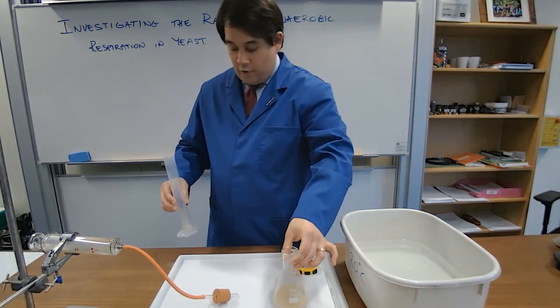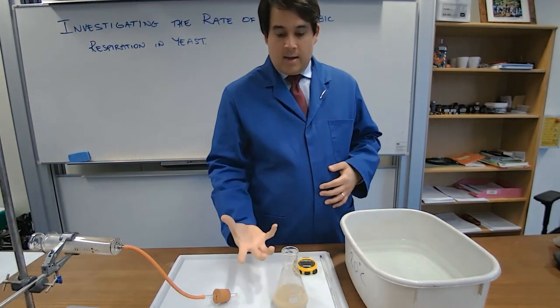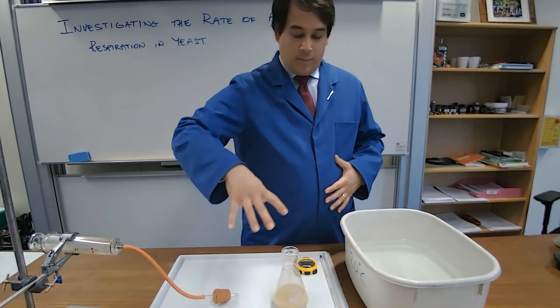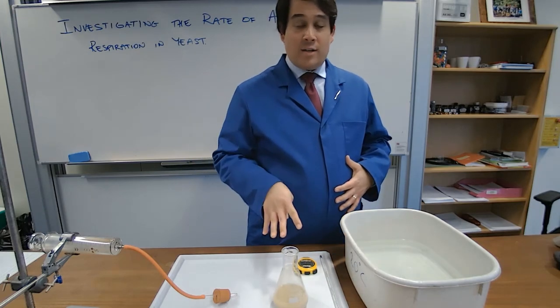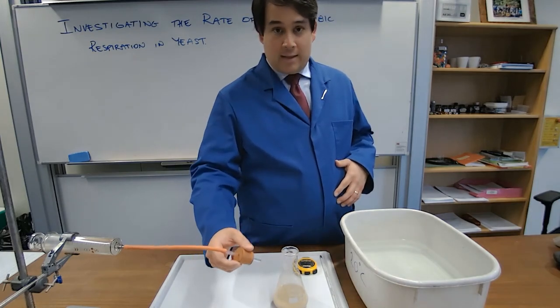Now, this layer of oil on top of the yeast should prevent any oxygen from going through it in that way because there's not too much pressure. However, any carbon dioxide generated by the yeast will come through it and we will then be able to collect it there.